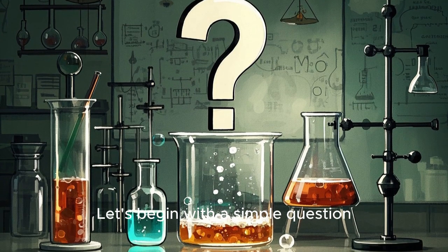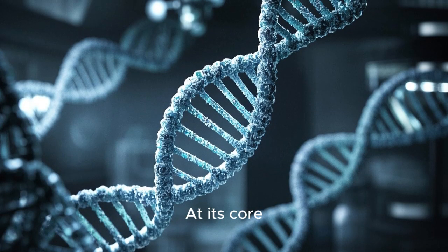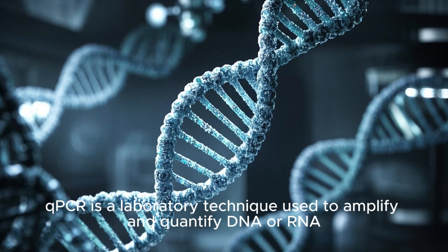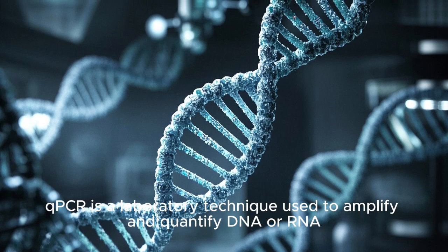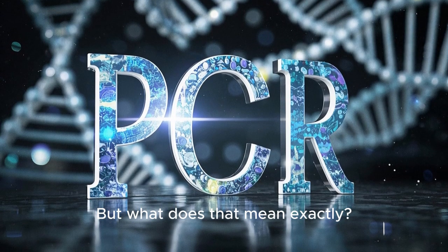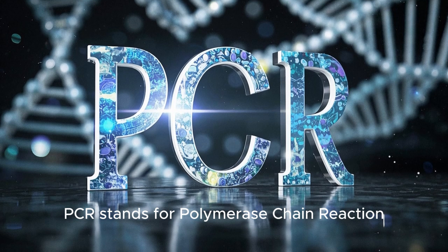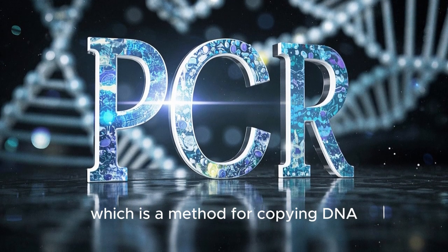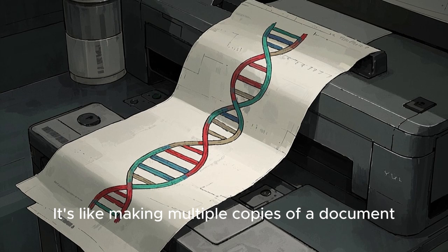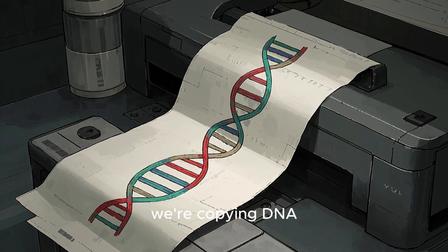Let's begin with a simple question. What is real-time PCR? At its core, qPCR is a laboratory technique used to amplify and quantify DNA or RNA. But what does that mean exactly? Well, let's break it down. PCR stands for polymerase chain reaction, which is a method for copying DNA. It's like making multiple copies of a document, but instead of documents, we're copying DNA.